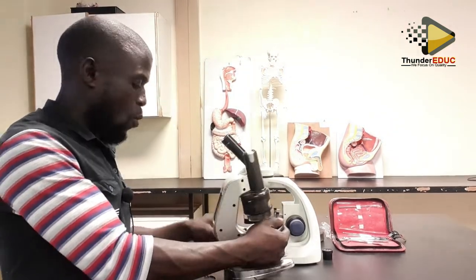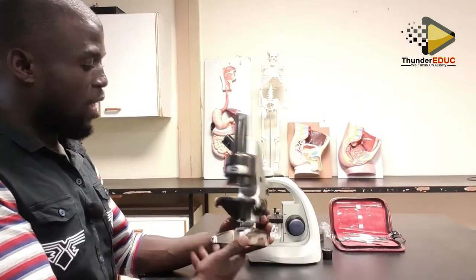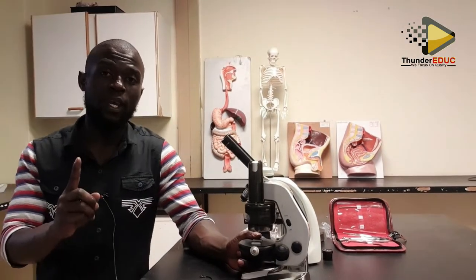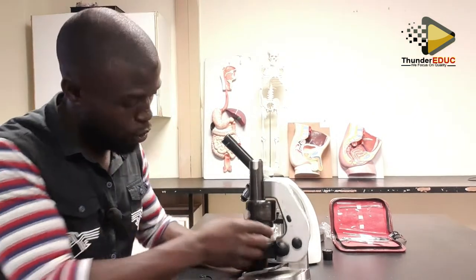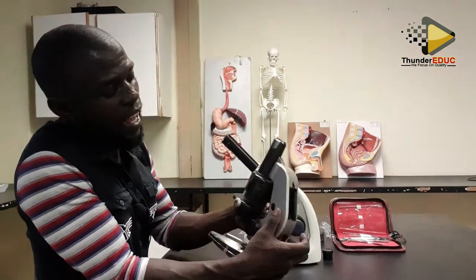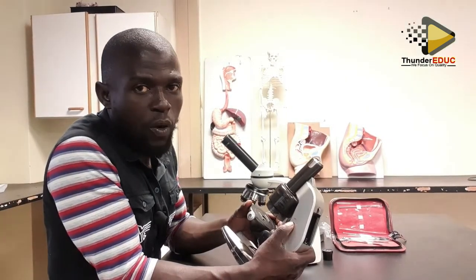What about the coarse adjustment knob and the fine adjustment knob? It also has the two. Always the big one is the coarse adjustment knob, and the smaller one is the fine adjustment knob. It also has the light, the switch to switch it on and off.